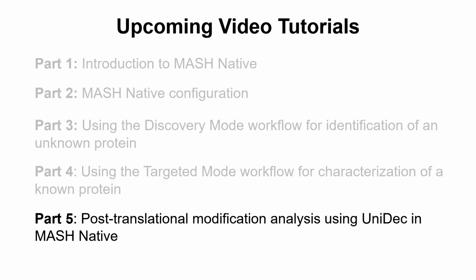Next, in part 5 of this short tutorial series, I will introduce the use of post-translational modification analysis using UniDec in MASH Native.